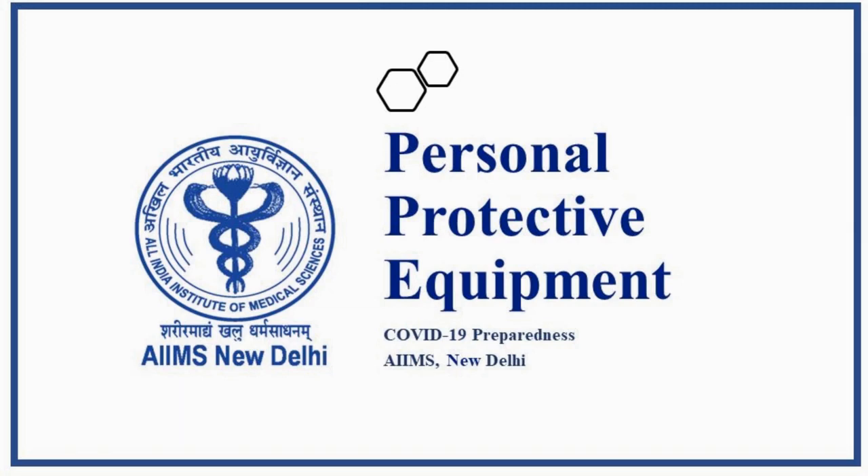Namaste. We from AIIMS New Delhi would like to demonstrate the donning and doffing methods in easy steps for the protection of our healthcare workers working in COVID designated areas.